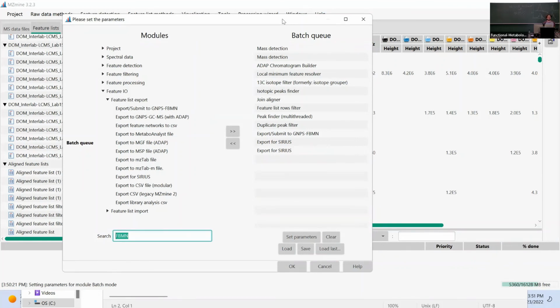Crashing a lot. So batch queue, like how to incorporate some of the data, try to process some data, and then just do the feature alignment and everything on all data at the end.